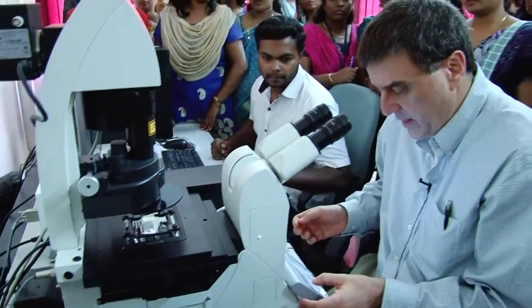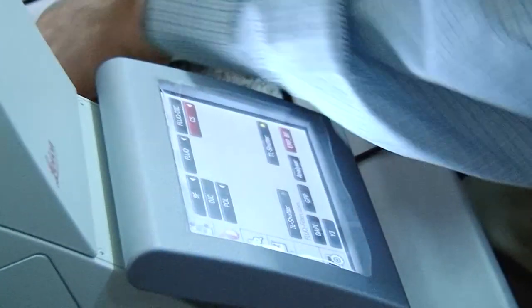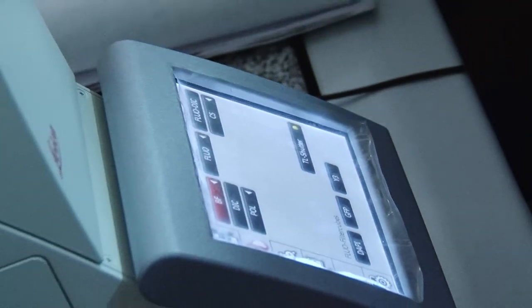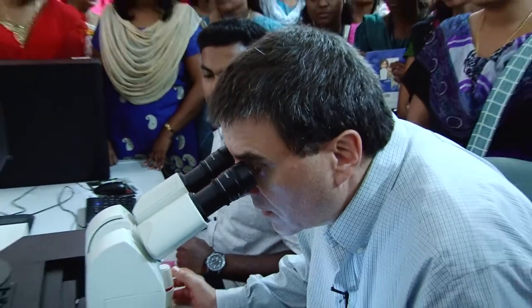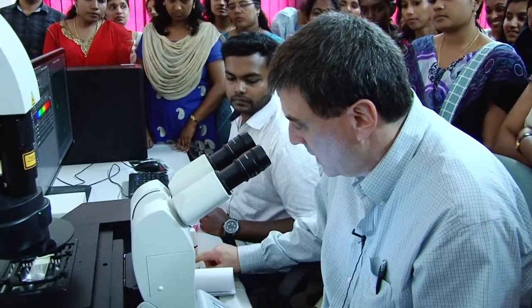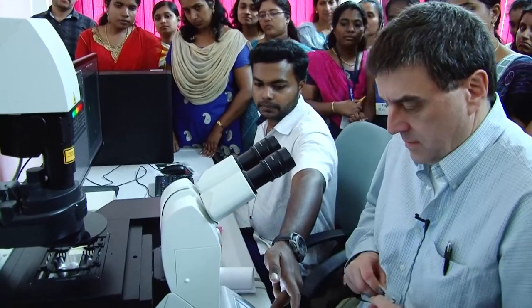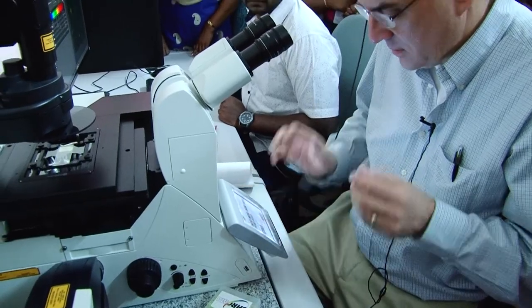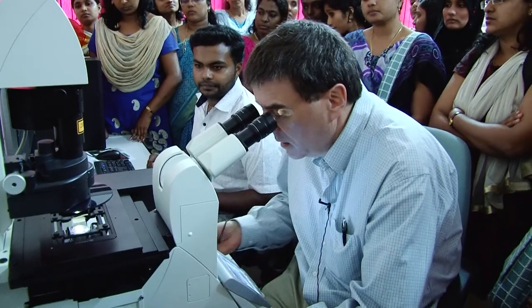Okay, so let's go back to transmitted light. And let's just see if we can see the pollen grains. Or actually, I don't know if it's pollen grains. I think it's marine diatoms, but nonetheless. Okay, perfect. And let's go up to 20. See, it's weird. I've got the exact same scope, but the buttons are all in a different place. Like I said, this is the next generation, so everything's changed a little bit.